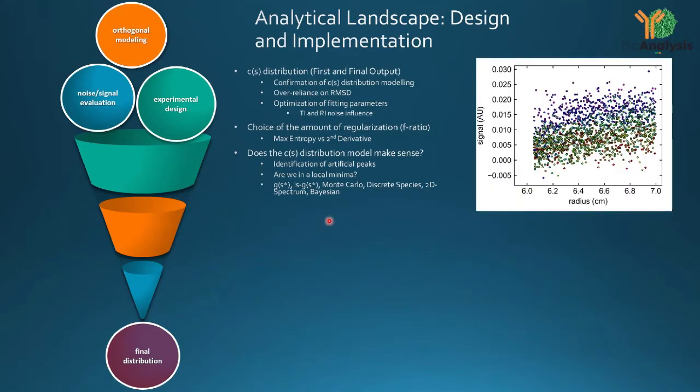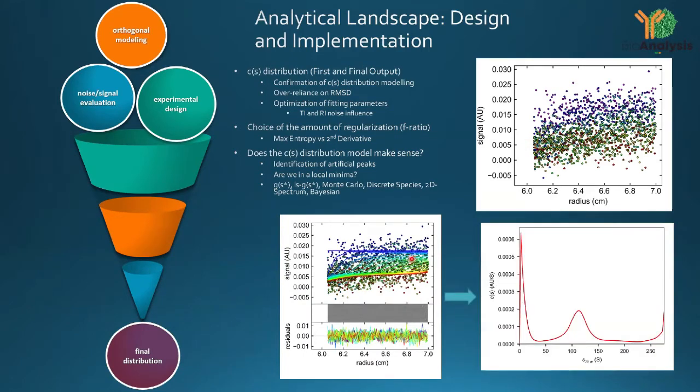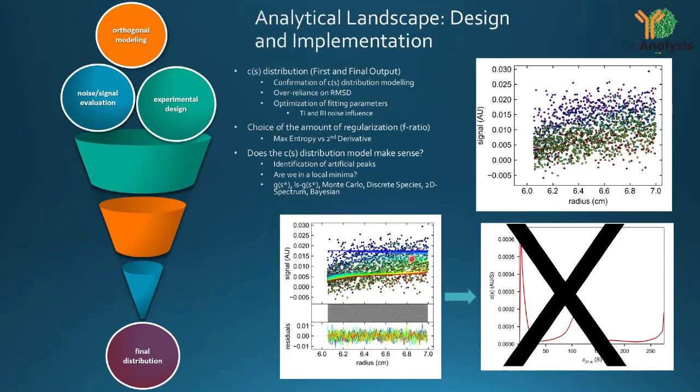Now, be very careful. I'm going to give you an example right now that will kind of shock you a little bit. This is data in which it looks like random noise, okay? We can fit that data. You see boundaries that the eyes can't see, but it will give you some information. Now, is that information correct? Probably not. So you've got to be very careful on how you fit the data and what concentrations you're using. What is your regularization? What is the best one?